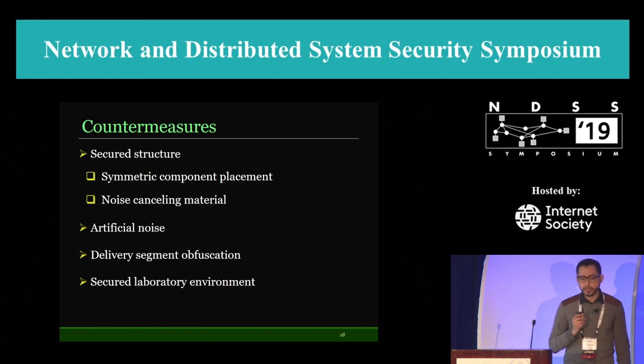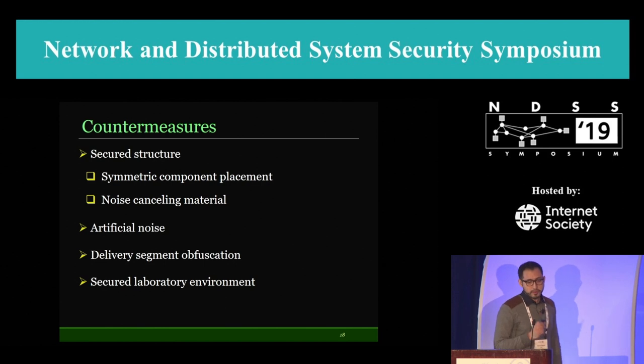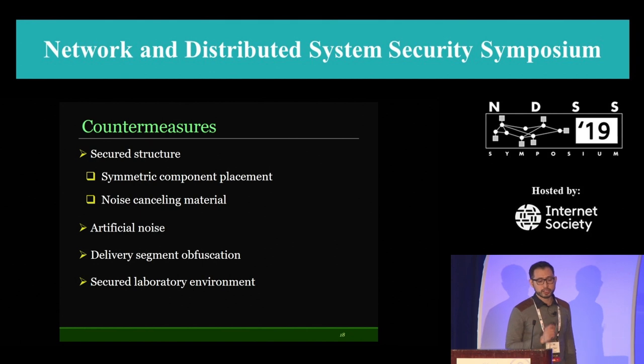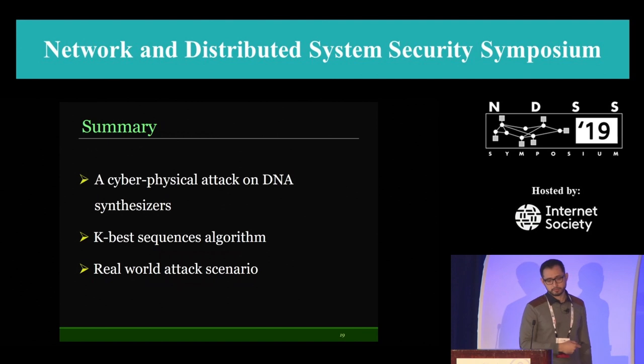Okay, so now that we have introduced the attack methodology, we also suggest a couple of countermeasures. We suggest that the DNA synthesizer designers should consider using vibration absorbent material and add artificial noise to their system. We also suggest that delivery segment obfuscation is a choice, and a secure laboratory environment is a must. So these were some suggestions, and we welcome the research community to come up with even better strategies to mitigate these types of attack methodologies.